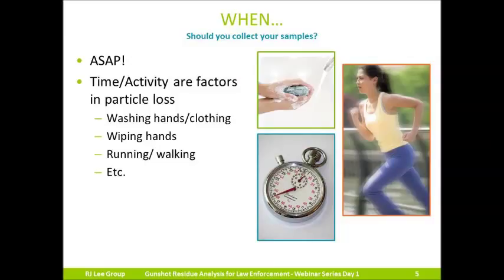RJ Lee Group does not utilize a cutoff time, believing instead in following what the investigating officers feel is of probative value. Now, if you collect samples from a suspect's hands 3 days after a shooting, we will analyze them for you if that's what you want us to do. But the chances of still finding any GSR particulate are very unlikely. 3 days after a shooting, the probative value of collecting samples from an individual's hands decreases tremendously.